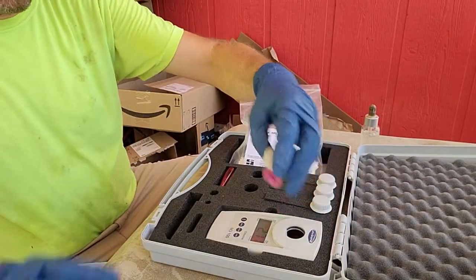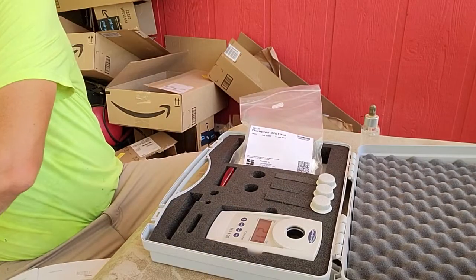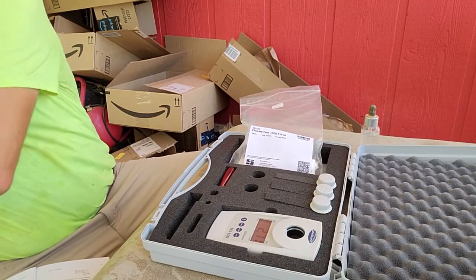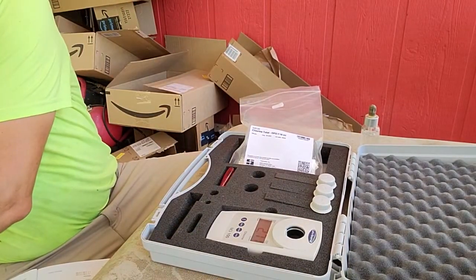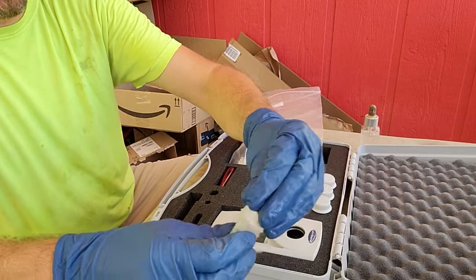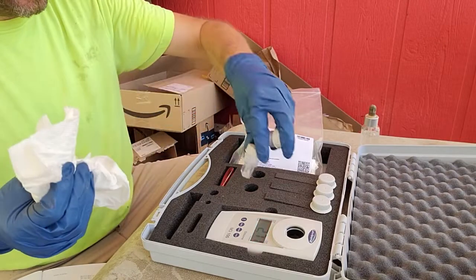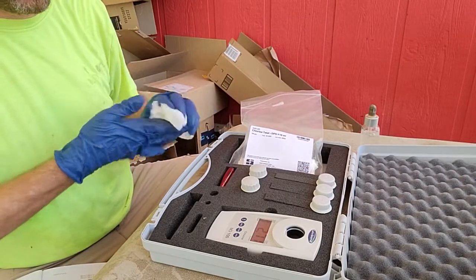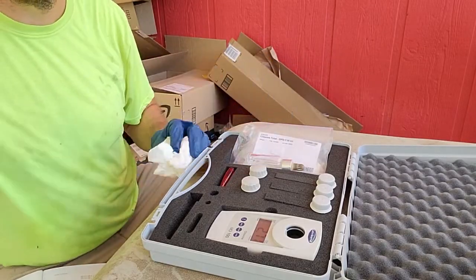That's how you use the new colorimeter we're going to have at the wastewater treatment plant. Go ahead and rinse out your vials a couple of times, clean them up, dry them off, and return them to the kit. Turn the colorimeter off and you're done. If for some reason when you turn it on it doesn't show CL8, just hit the mode button until it reads CL8, then hit the zero/test button to balance it.